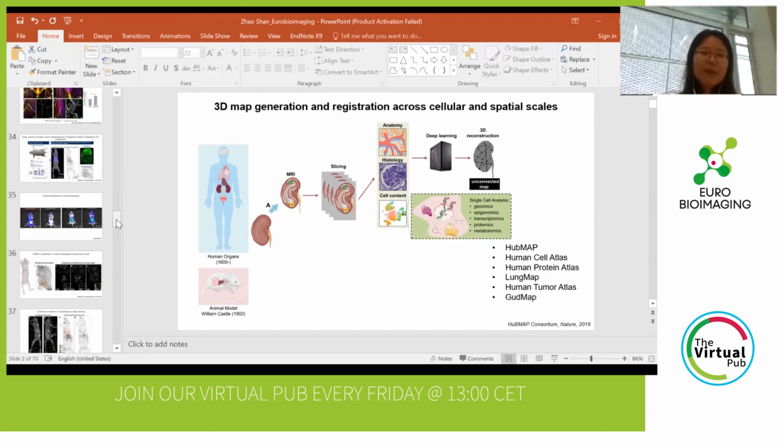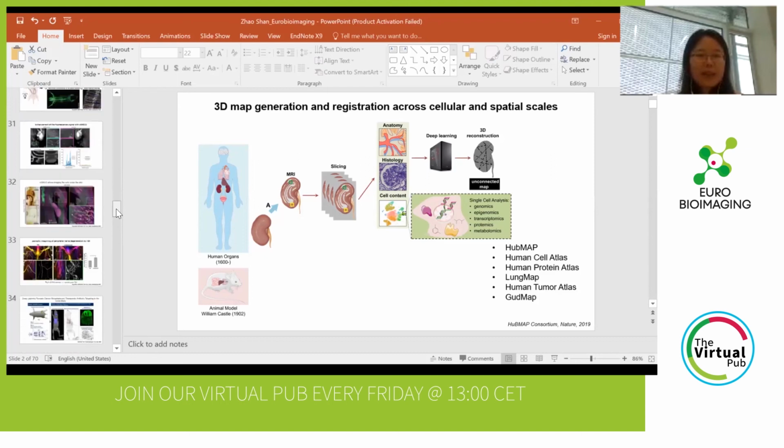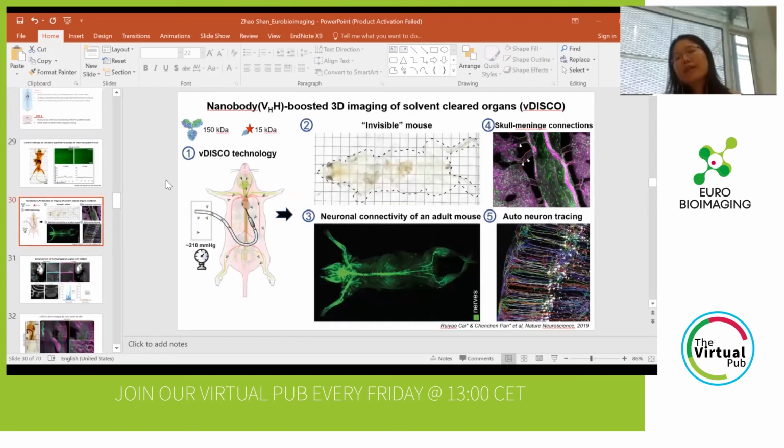Yeah, that's a very good question. For the disease model, in general, we will do at least 3 in each group, especially for the quantification data. So when you group your samples and do the surgery, there are no problems.